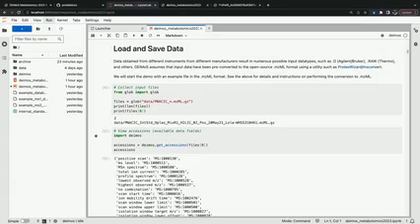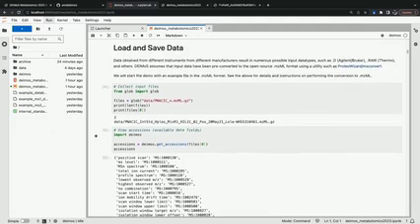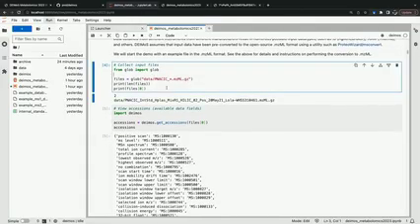They have an MSConvert utility, so that's alluded to in the documentation. And there's a link to ProteoWizard as well in this notebook. But to start, we're starting with data that's already been converted into that mzML format for the purposes of the demo. And so here, I'll just start by running this notebook.